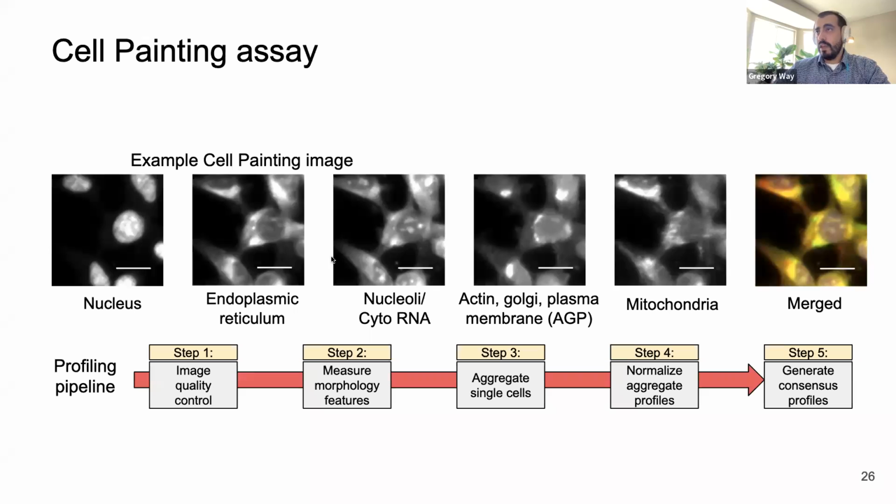This is an example of the complexity of the image, even in a single cell line, which one might think is rather homogeneous. There's really quite a lot going on. You have these exploding cells with very high DNA damage. You have cells throughout the different stages of the cell cycle. There's quite a lot going on.